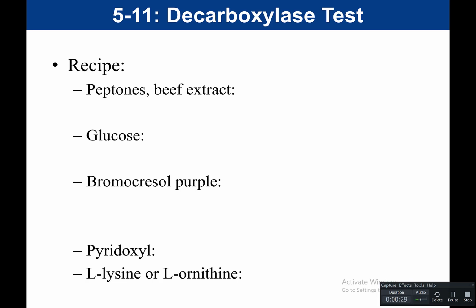In the last unit, we were looking at how bacteria use sugars. And so we did an ONPG test, and a phenol red test, and an OF test, etc. Those tests were looking at how bacteria utilize sugar. In this experiment and in this unit, we're looking at protein metabolism. We're looking at how bacteria metabolize protein as a food source.